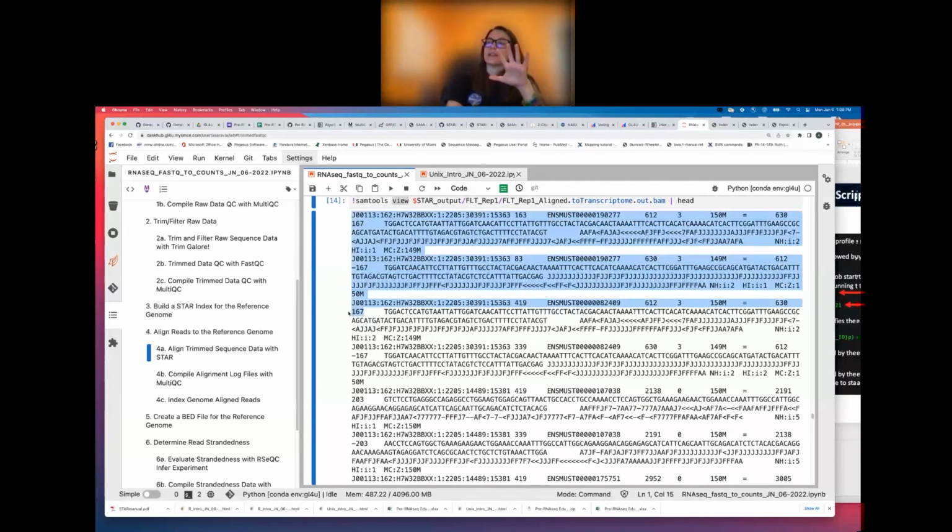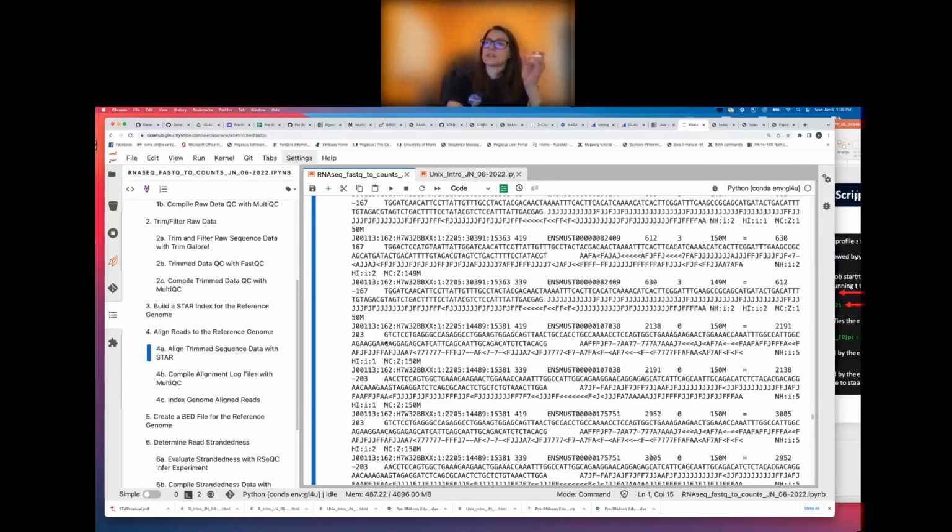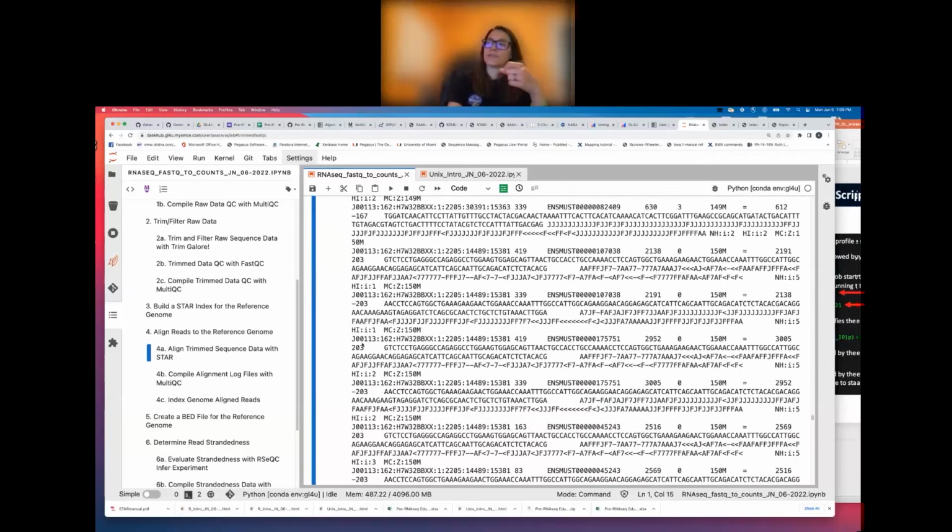This read, which is the same read as above, but this time aligning to a different transcript in the same orientation, its mate pair aligning in the opposite orientation of the transcript. You can go down like that, and then we have the 3 transcripts that the other mate pair is aligning to. Again, one mate in the positive direction, and then its mate pair in the opposite direction with respect to the reference.